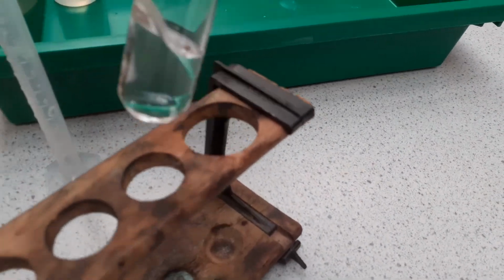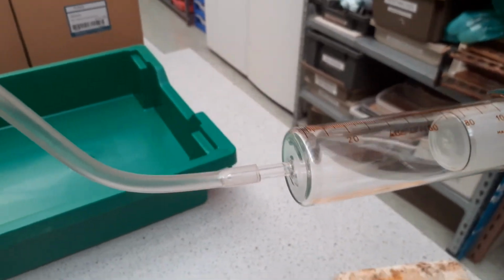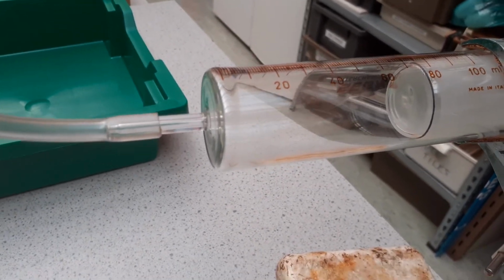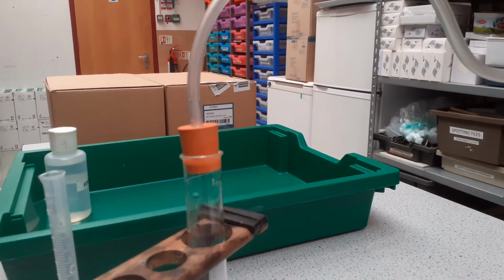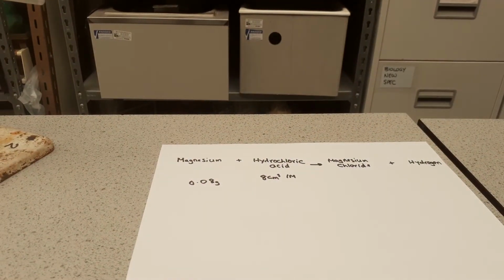As you can see now, the reaction is finished. All the magnesium has been used up. So let's get the volume of hydrogen produced. Looking at our gas syringe, you can see it's not moving any further. And looking at the measurement, we've got 80 centimetre cube of hydrogen produced. So let's go back to our table here now. 80 centimetre cube, and let's just put that on.